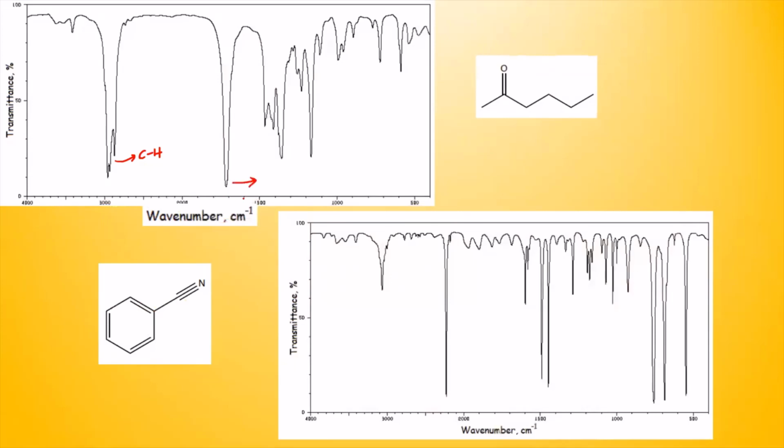What is it? 1500, 1600, 1700. This is very, very strong, and it's usually an aldehyde or a ketone that corresponds to a C double bond O. Right away, we know this is our structure. Bingo. Now, there is a C triple bond N. If you go to the table, there should be a really, really strong peak at 2250. There you go. 2000, 2100, 2250 right away. These peaks are very, very strong. So all you're looking for is, you see how quickly I got there?